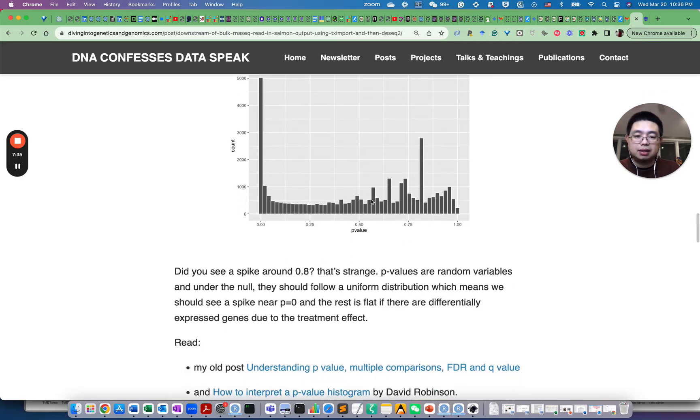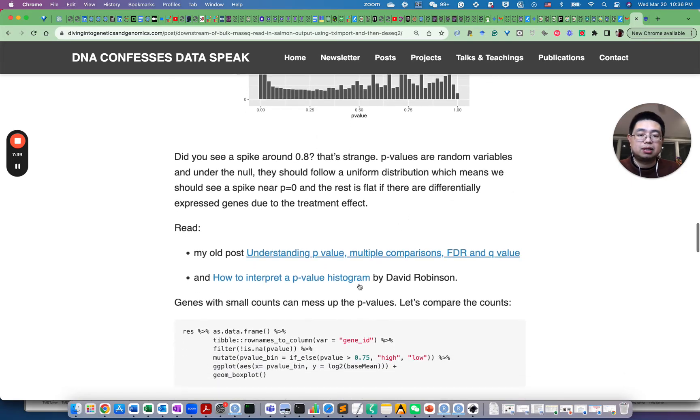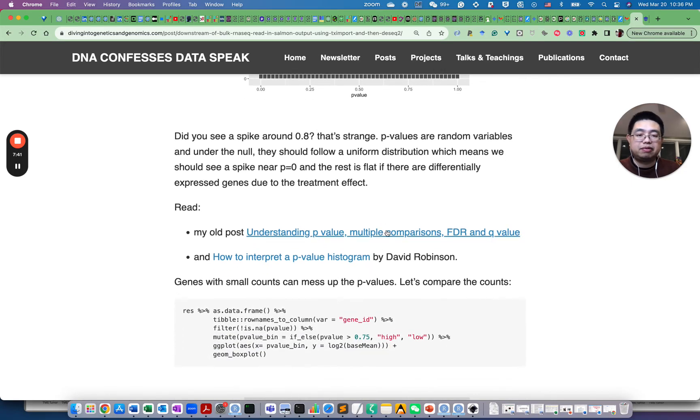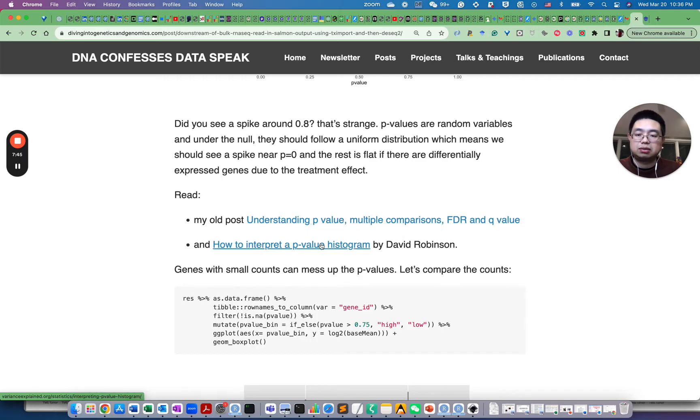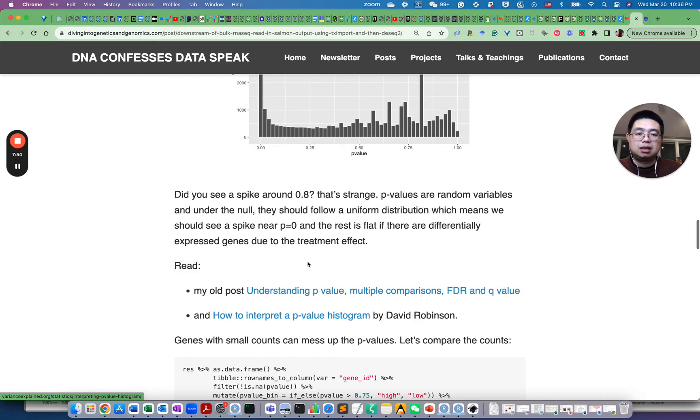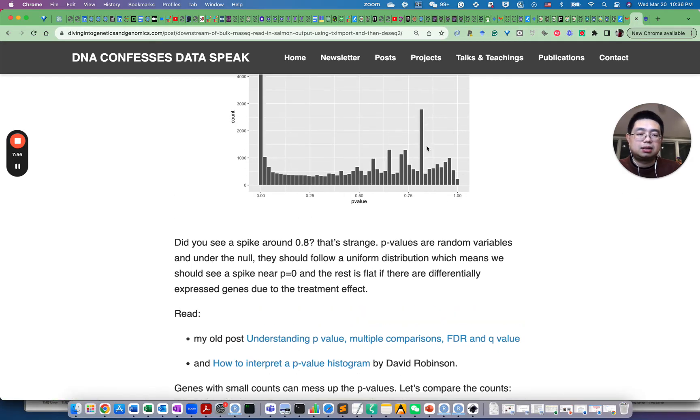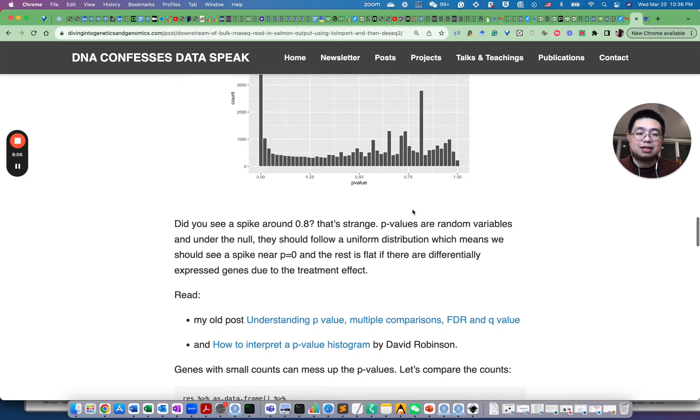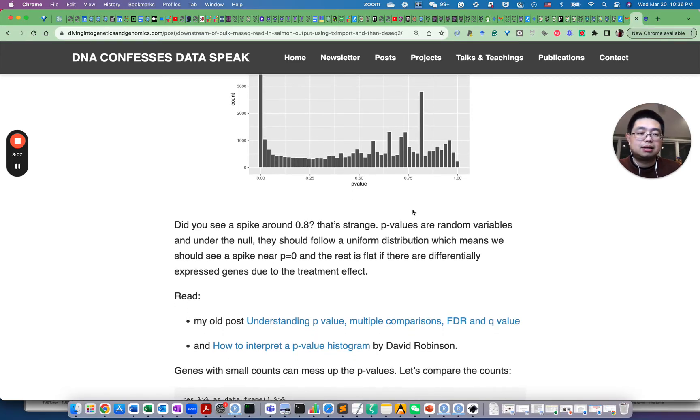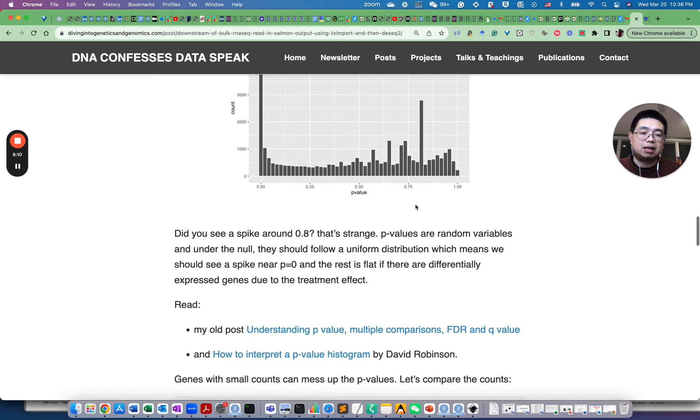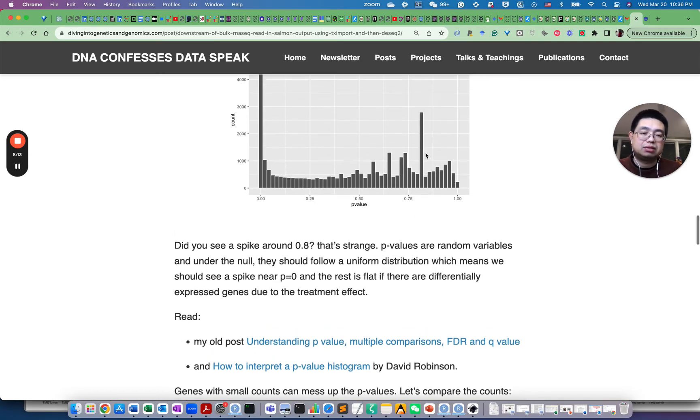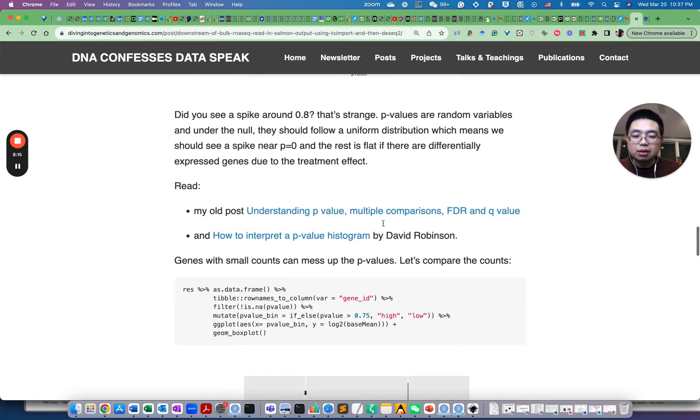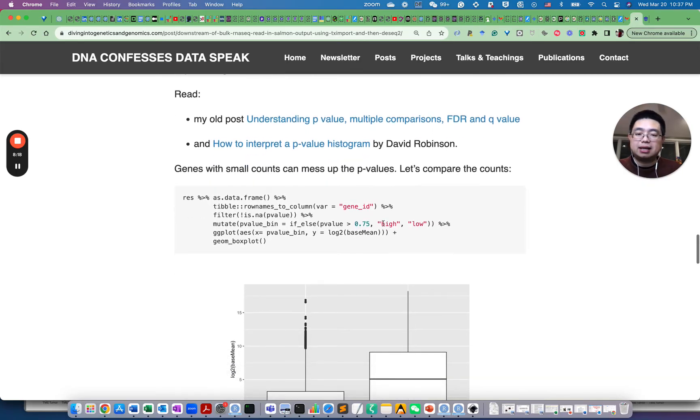So you can further read my previous post on p-values and multiple comparisons FDR and q-value and also this blog post, how to interpret p-value histogram by David Robinson. So in this blog post, he mentioned that if you see some peaks even around p-value equals to one, that means there's something wrong with the data. So in this case, I was suspecting maybe those genes with very few number of counts is messing up here. And that was just my guess.